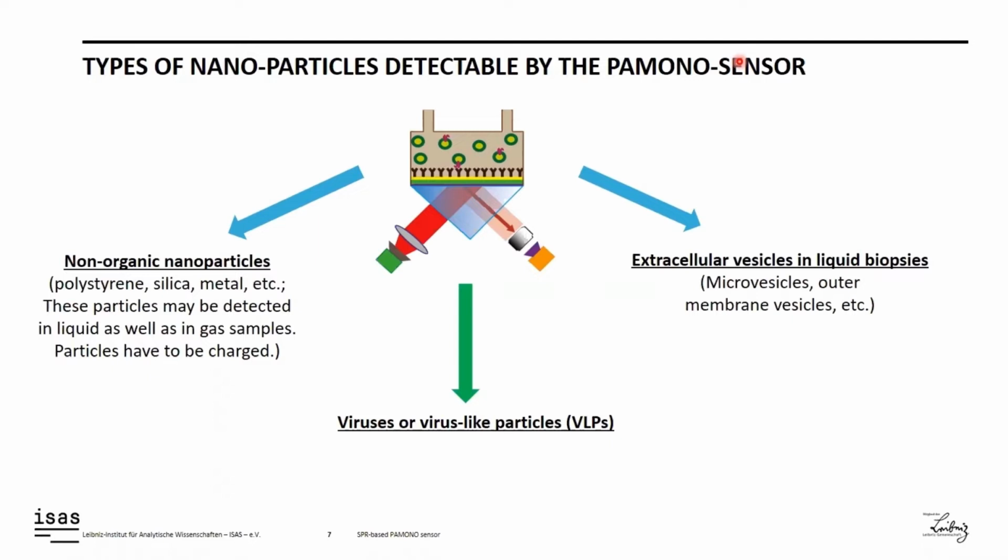So for the future, it would be important for us to expand the area of detection. Currently, we can detect only those signals which are focused. We count them, and this helps to quantify target particles in the sample. However, in the future, we hope to be able to also analyze signals which are in the non-focused area.